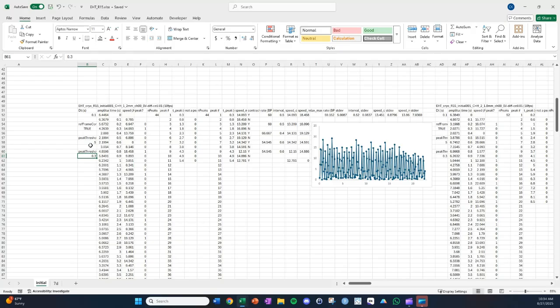These are pretty good values, but not perfect. So I think they're good values probably for analyzing this particular video. And the reason I say that is because of two things. Looking at the peaks here, if you count them, there will be 44 peaks.